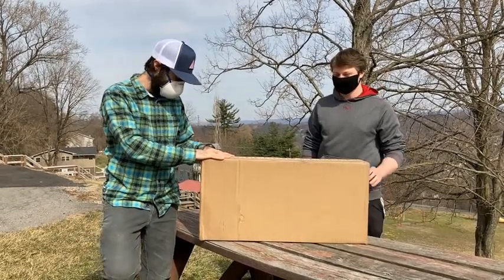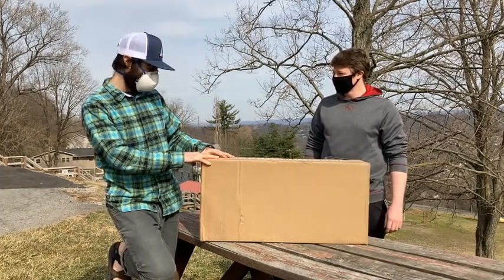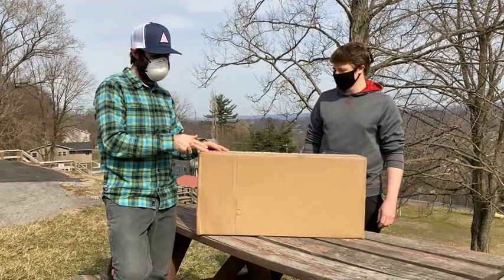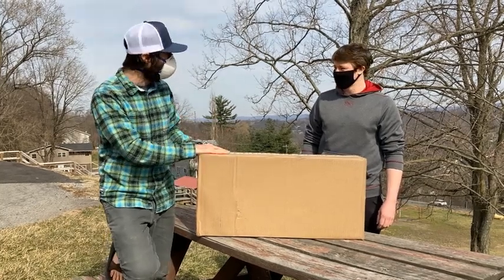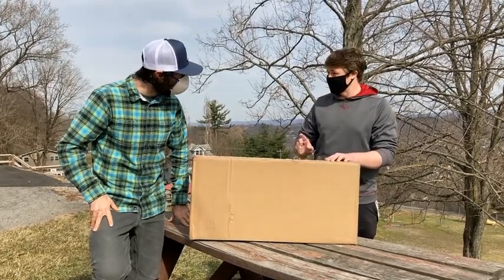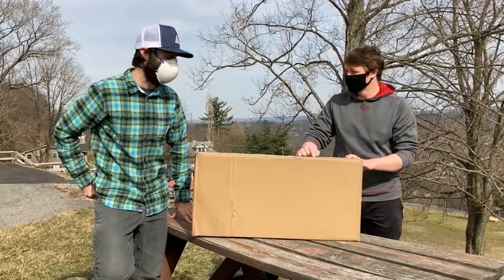What we have here is hopefully a data logger, and this is going to help us with all kinds of nifty scientific stuff. Right now when we do our data monitoring, we actually go out on specific days — just single moments in time. Why is this monitor different, Jonathan? This will be giving us data 24 hours a day. That's a lot of monitoring! I am so excited to get this thing going.